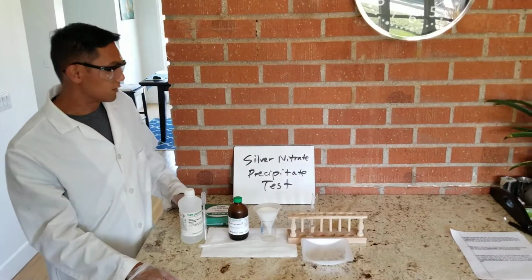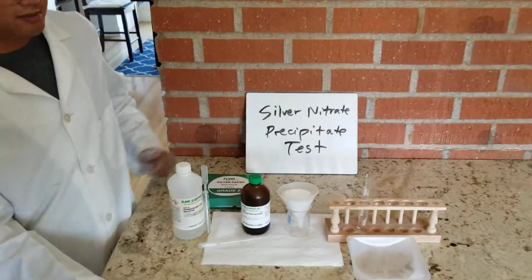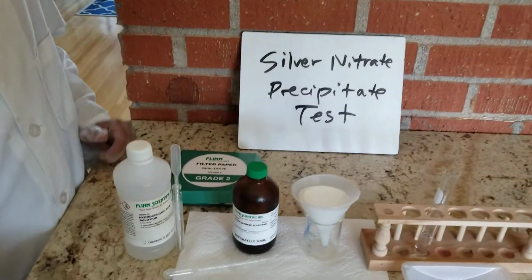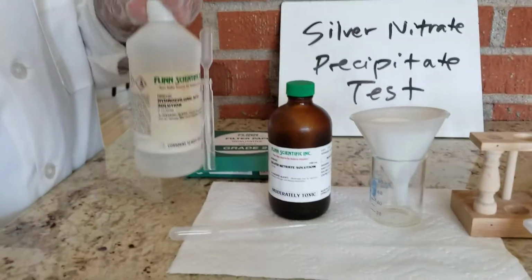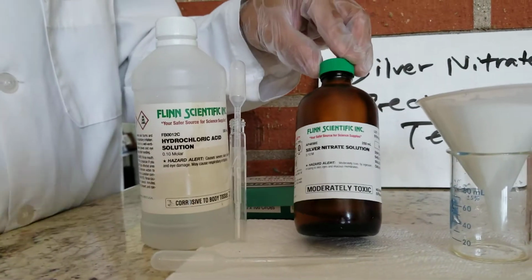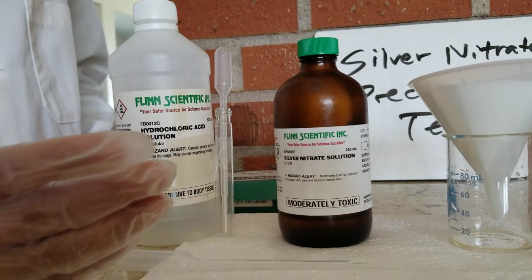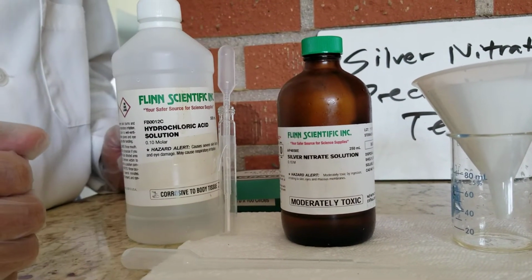In this demo, it's called the silver nitrate precipitate test. We have quite a few components and actually a couple of parts to this demonstration. Our two solutions are hydrochloric acid, this time we're using 0.1, and silver nitrate. It's moderately toxic, so it's something we really have to be careful with. And it stains, so I need to make sure I'm wearing gloves for this.